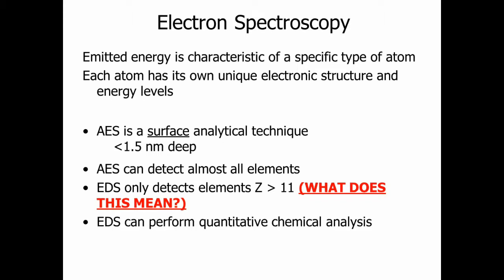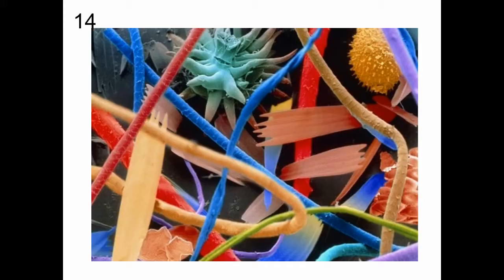What does that mean? That's an atomic number greater than 11, sodium. EDS can also perform quantitative chemical analysis, meaning you can figure out exactly how much of something is in your sample.